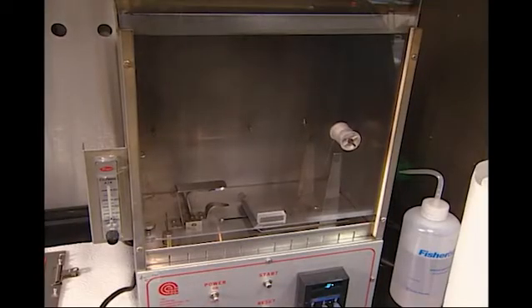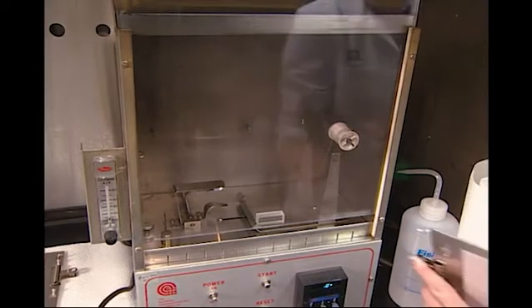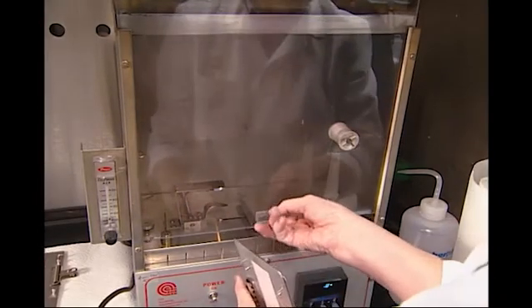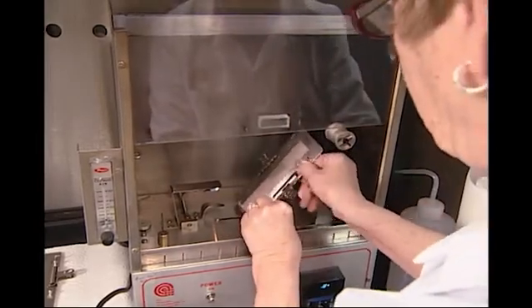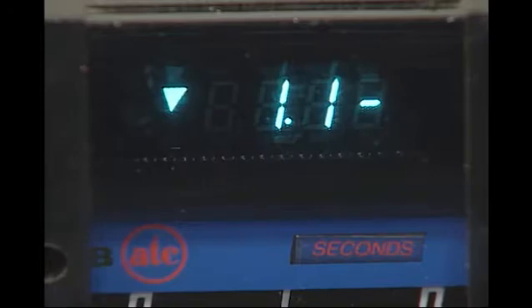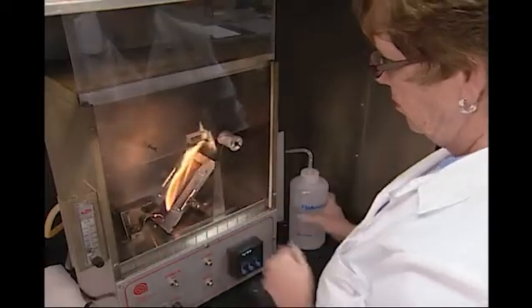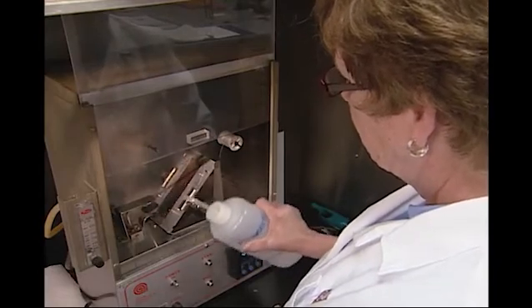The test chamber consists of a stainless steel apparatus with a glass closure that allows the test to be observed. Inside the chamber is an inclined 45-degree platform on which a specimen holder is placed. The apparatus has gauges for controlling flame height, a release button to activate flame impingement, and a timing device. The test apparatus is always used under a laboratory hood with the fan turned off during testing.